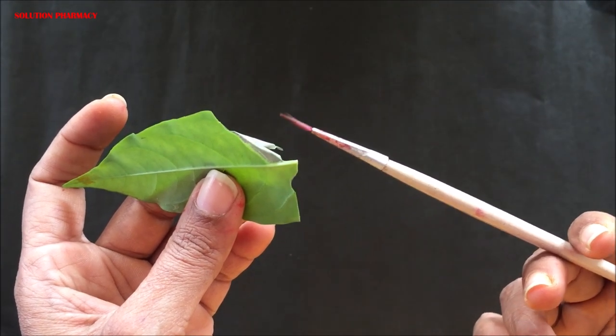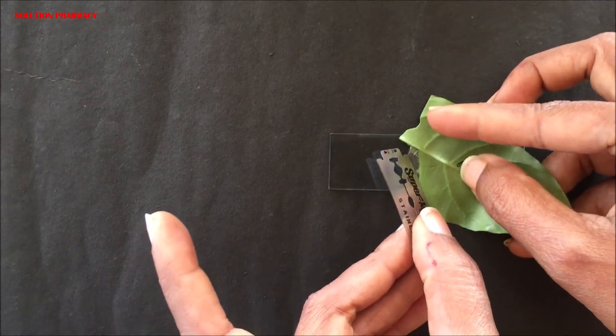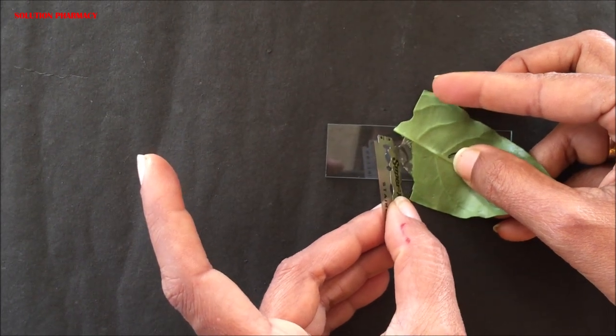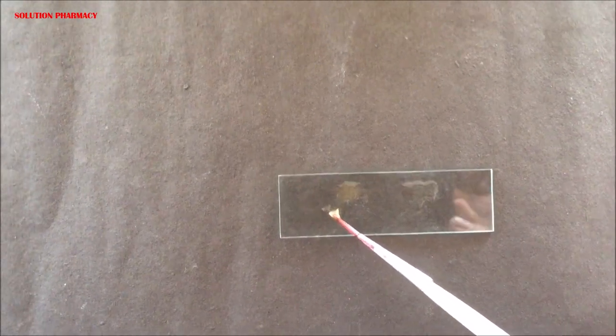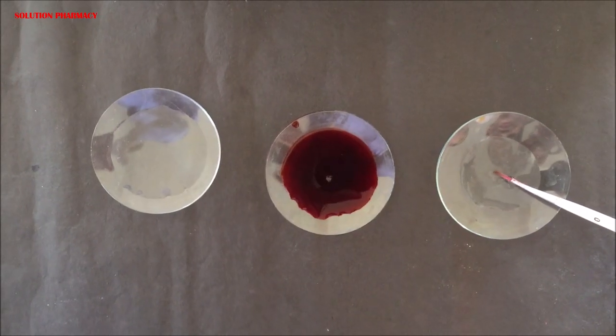Remove the excess part of the leaf. The part containing the epidermal peel should be cut and separated. Place the leaf part containing the epidermal peel on the slide and cut and separate this thin transparent layer from the leaf with the help of a razor blade. Then transfer this small portion of the epidermal layer into the watch glass containing plain water using a brush.